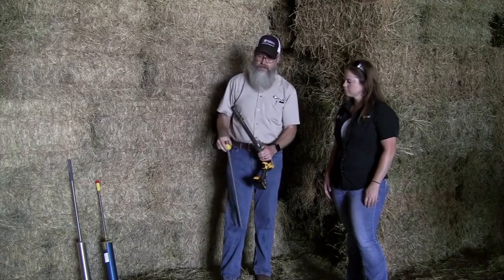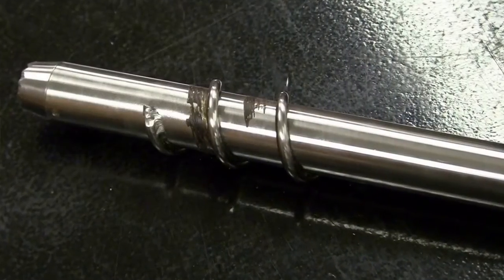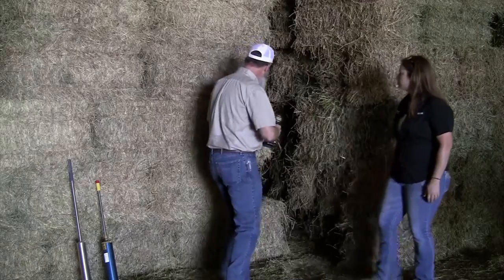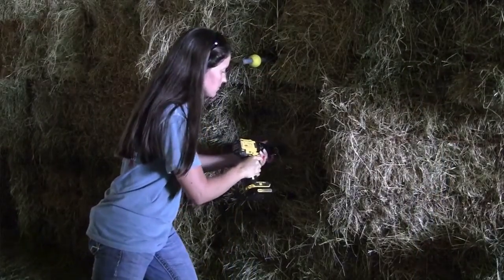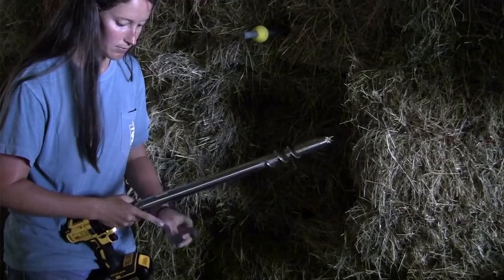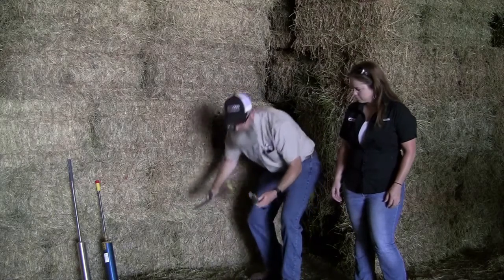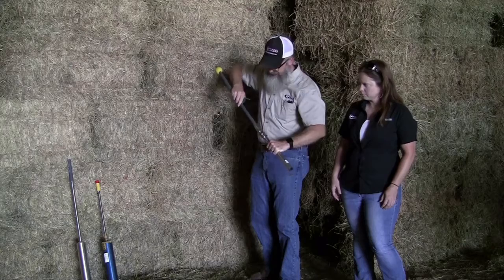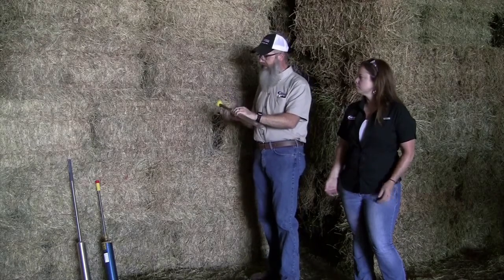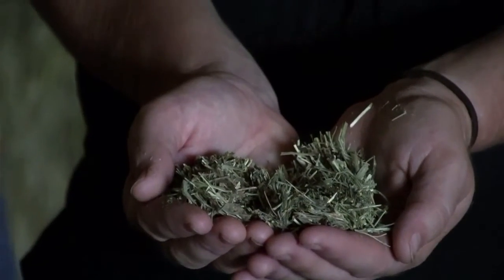This particular model of a Penn State probe is about an inch in diameter, and it's got some flighting here on the core itself, so it actually helps pull into the bale. So if we were to go right into the side of this bale, it just pulls right in real easily. And then all we need to do is take this out, pull the pin, pull the core out, and then plunge the core. Now this is where it gets a little bit dicey. You want to make sure and put your hand behind, once you got it started, put your hand behind here, behind the protector. So if you catch that for me, we can kind of show the camera a little bit about what we get.